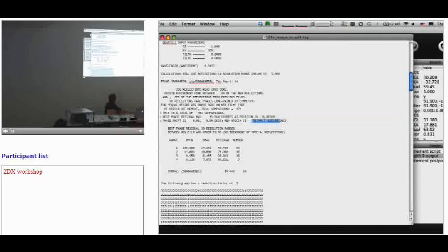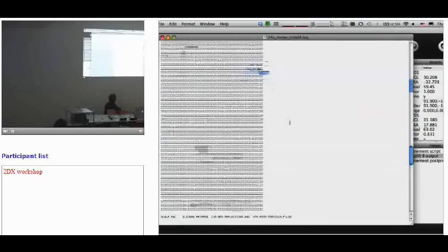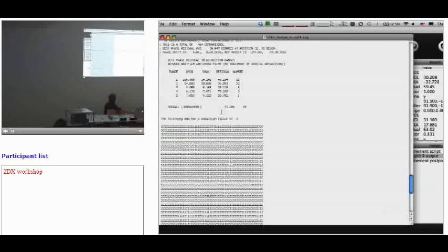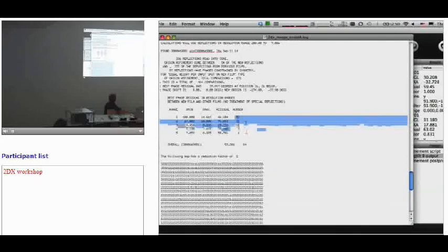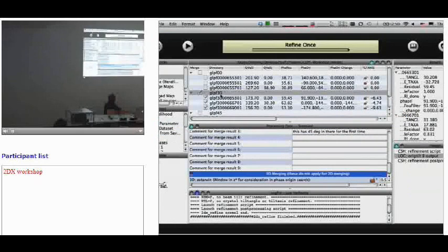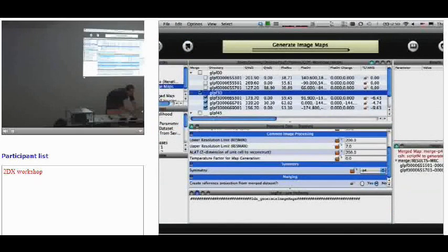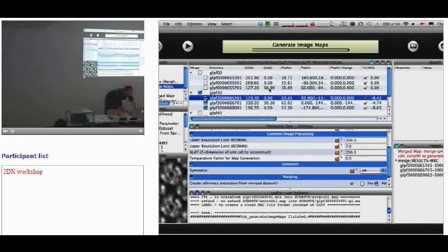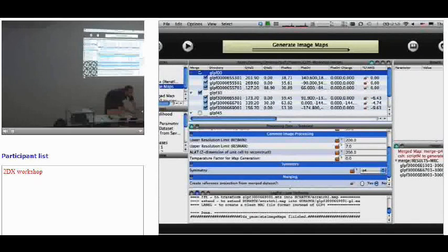And our addition to this program is that this is not only in the log file, but also modified so that it goes back into the database. And this happens for the first, for the second, and for the third picture. Each of them has a peak somewhere in the cross-correlation map. And there is a sufficient number of spots that was used for this alignment. So now we have merged these in there. Maybe I look at these, I regenerate these maps, and so we can look at the freshly made phase residuals, and they are correctly centered roughly. And now we merge them all together here.